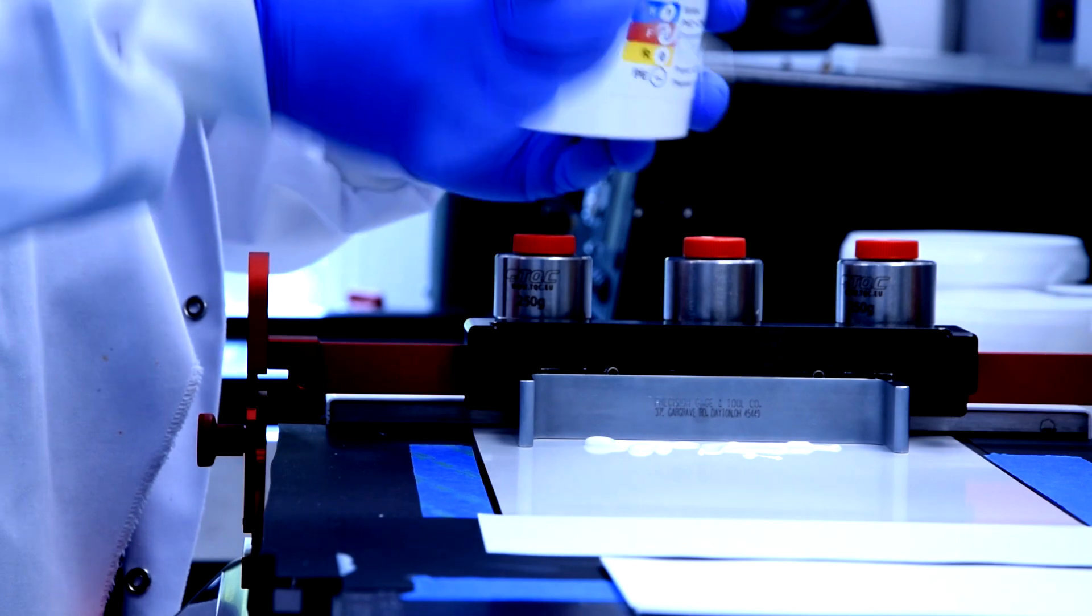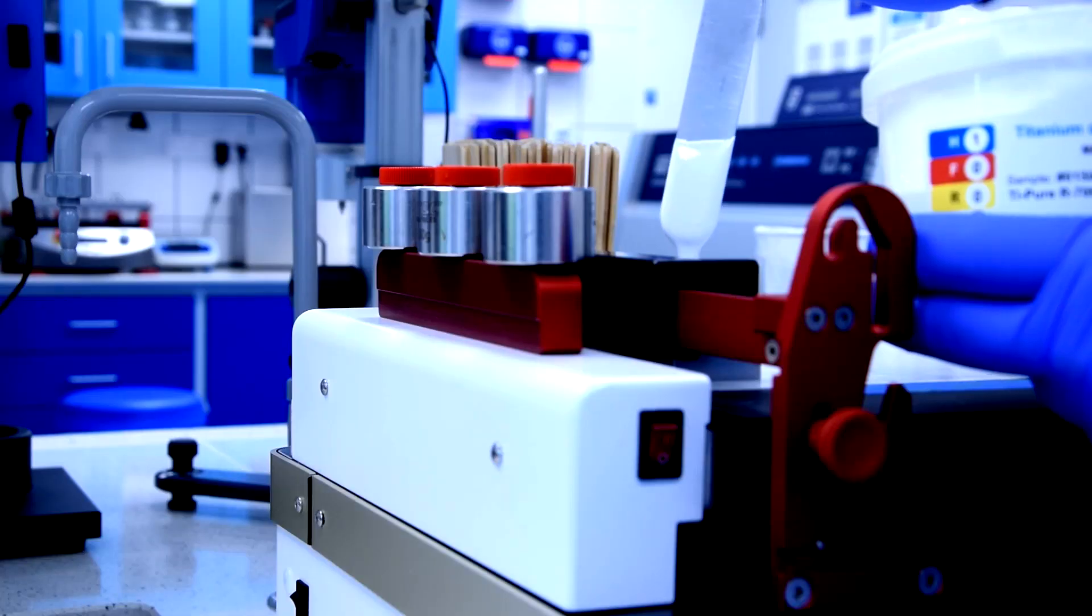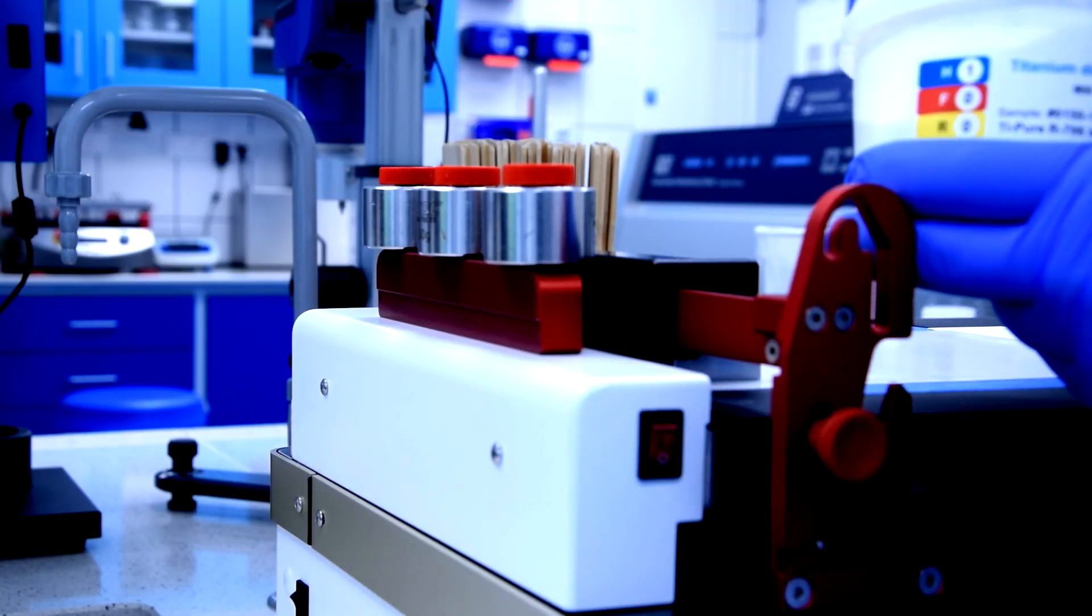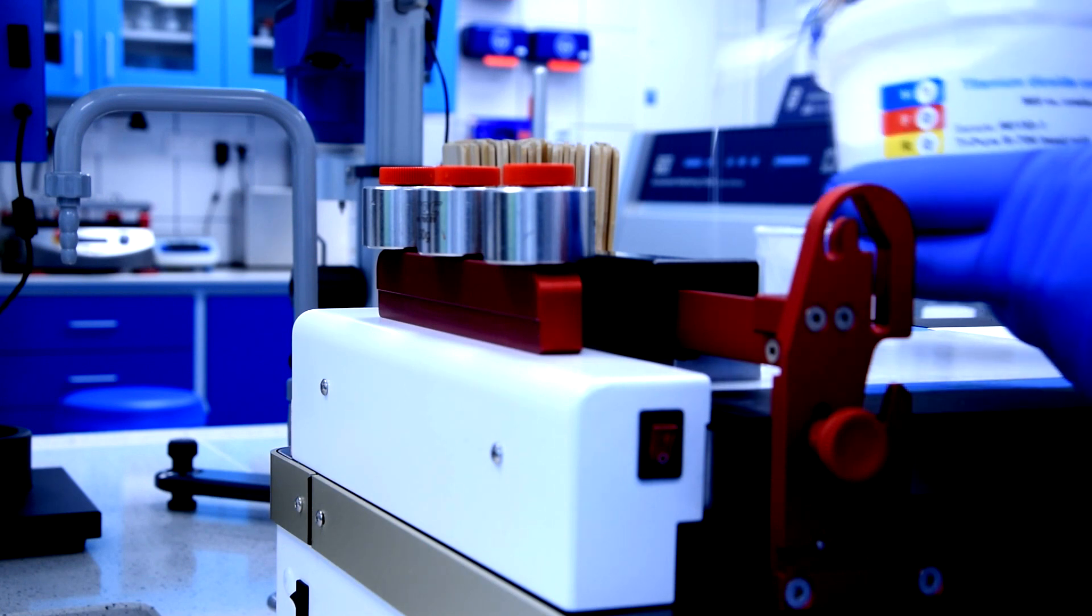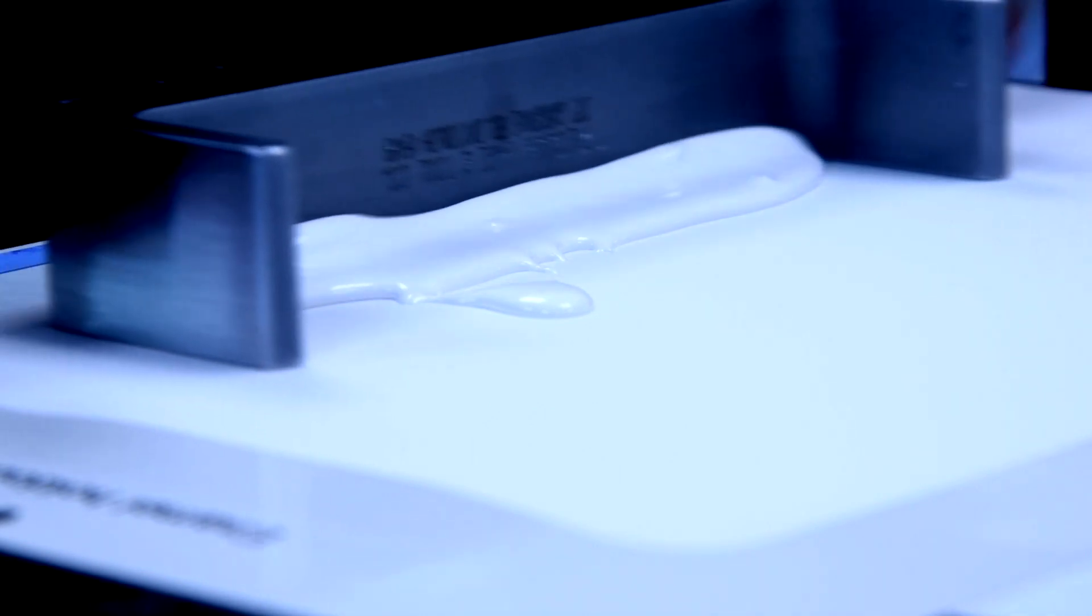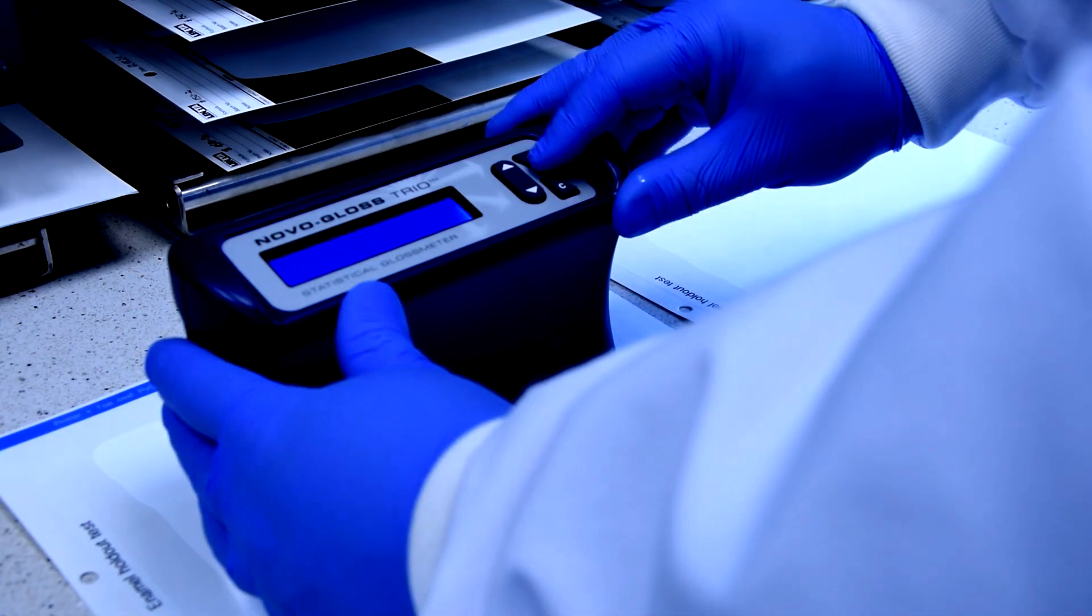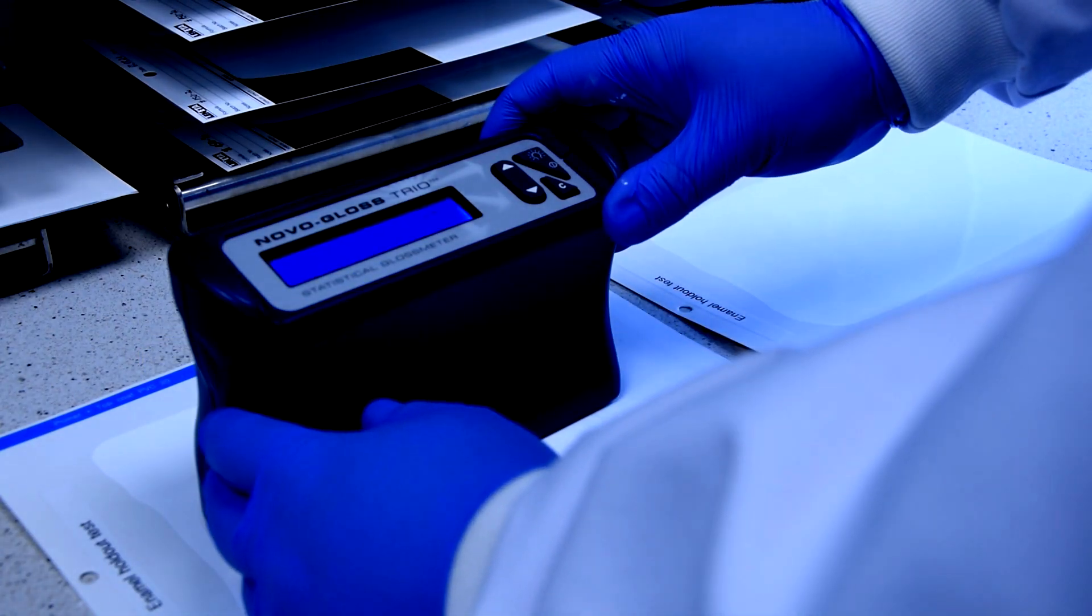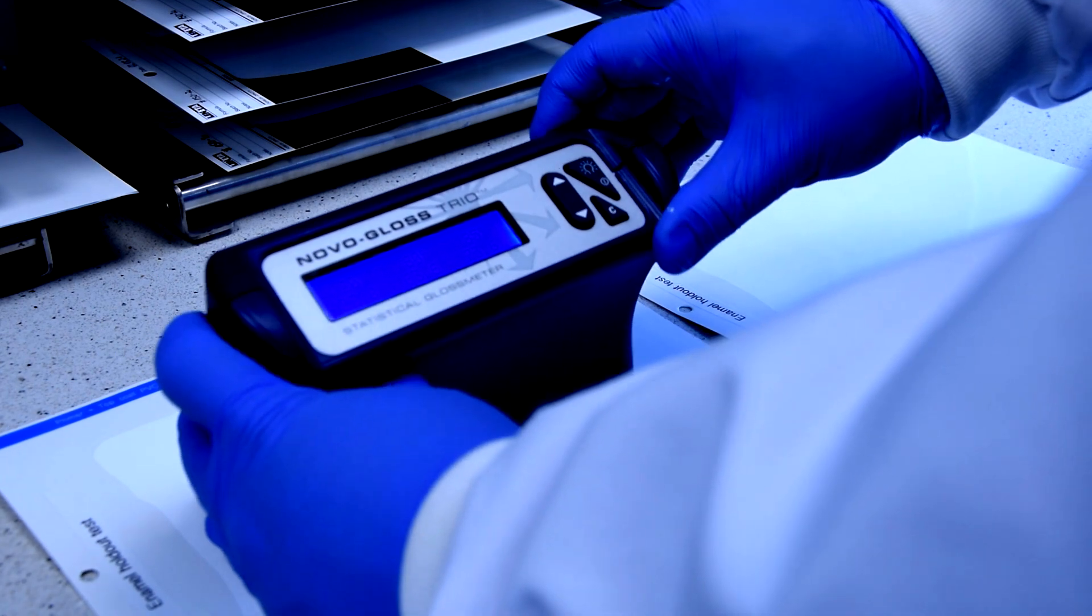For applications in which primers are to be used prior to applying gloss paints, we test the formulations that prevent excessive penetration of top coats into the undercoat coatings and define enamel holdout as the gloss retention in relation to the top coat applied without a primer.